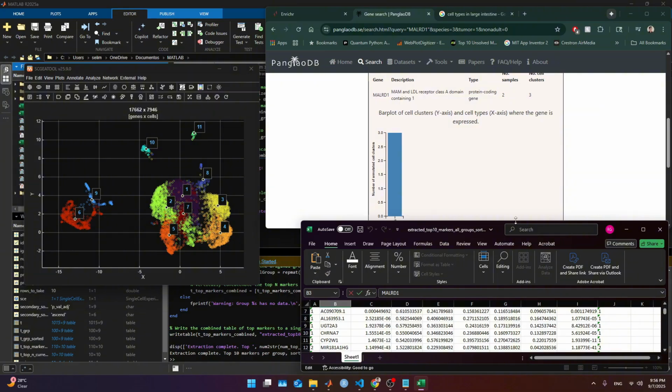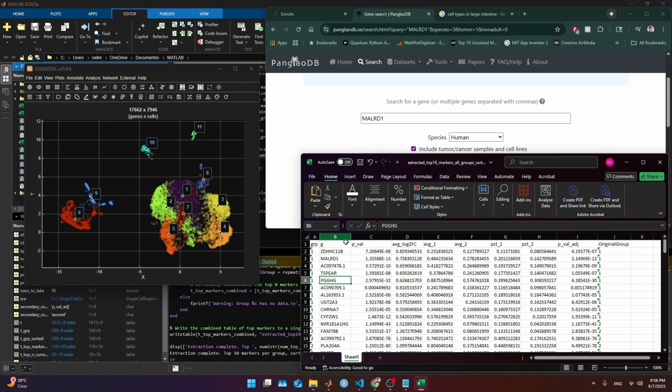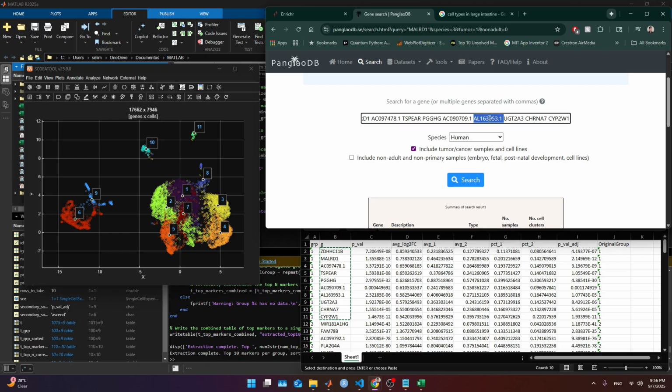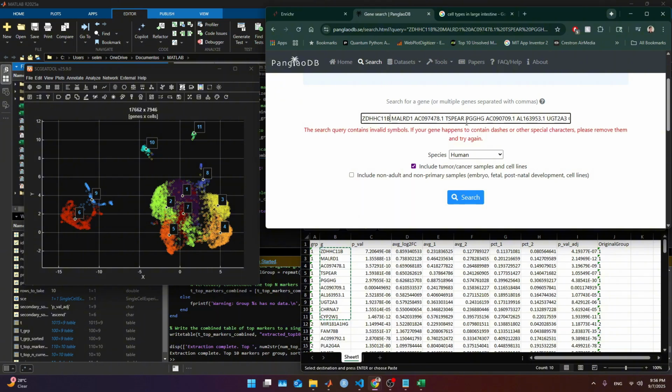So again, I can go and look for, maybe this one might make sense, but still we can grab them in collection and try to put it and search for them. I think we need comma, and so forth. And it's gonna tell us if something is there.